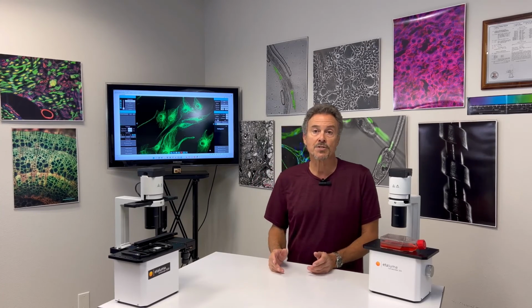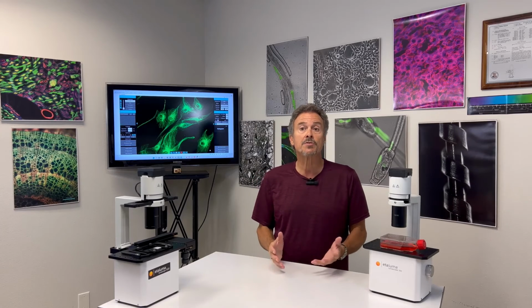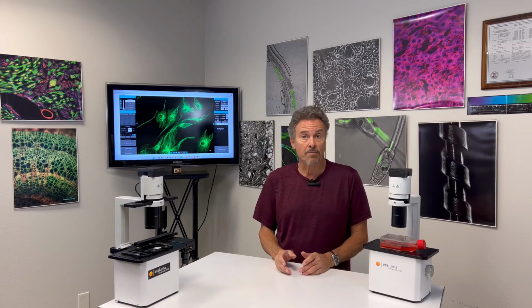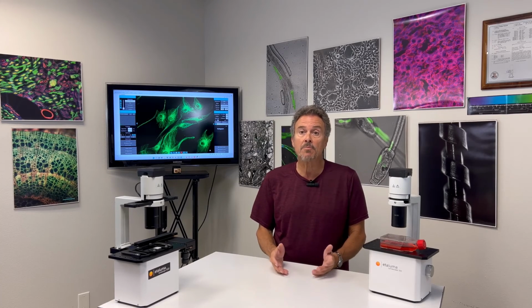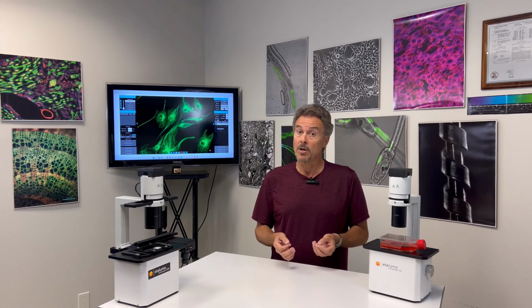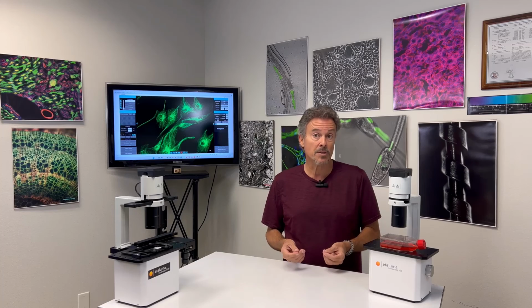So the answer to the question, what is our resolution, is that it is the diffraction limit, or around 250 nanometers, or a quarter of a micron, at 40x and above. And as I've mentioned before, the role of the microscope is to preserve the resolution provided by the objective lens. And so as long as the objective lens has sufficient NA, this will be true.